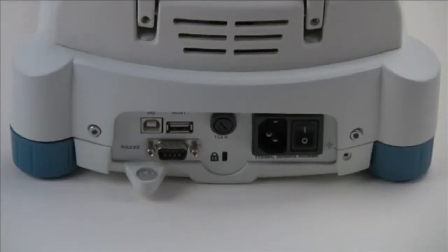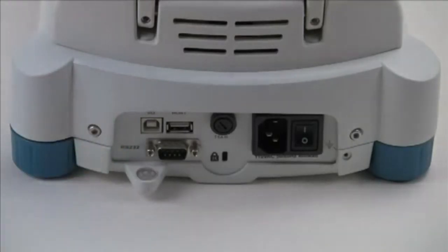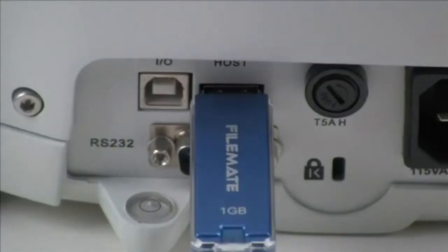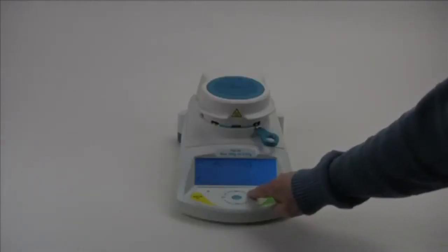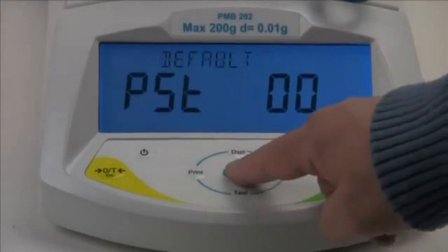Bi-directional RS-232 and USB ports allow you to connect to computers and printers easily. Adam's PMB allows you to quickly store and recall test routines and results from many different products.